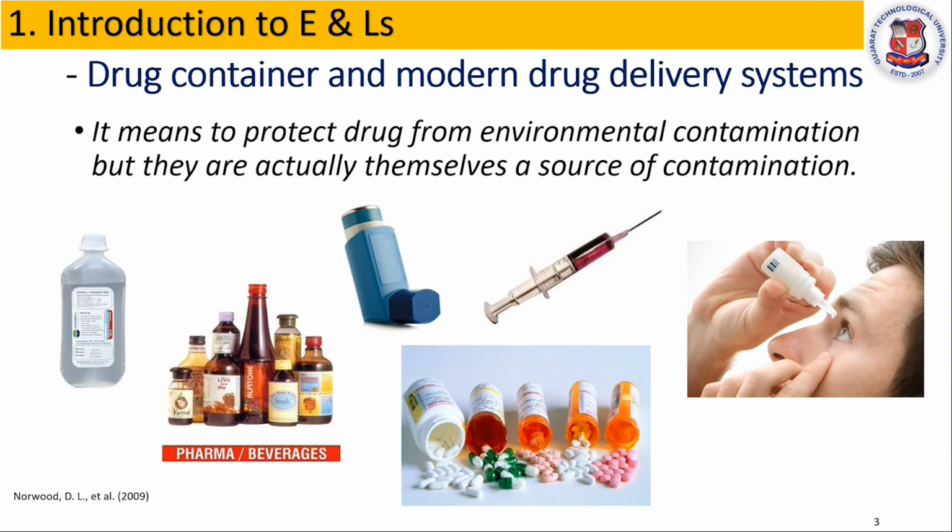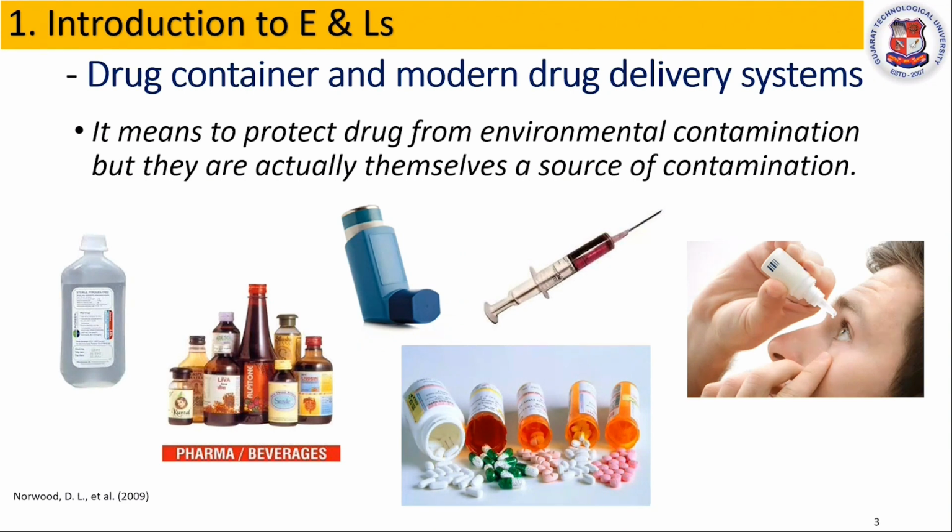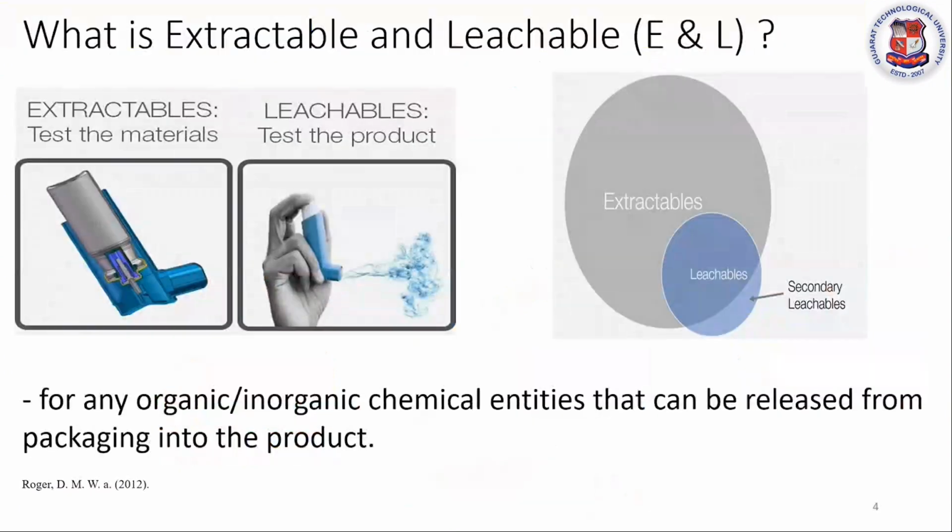Many pharmaceutical preparations are packed in plastic containers, and the plasticizers used to make the plastic are freely bound to the container. This freely bound component can be easily leached into the product and then contaminate the product, and sometimes they are harmful.